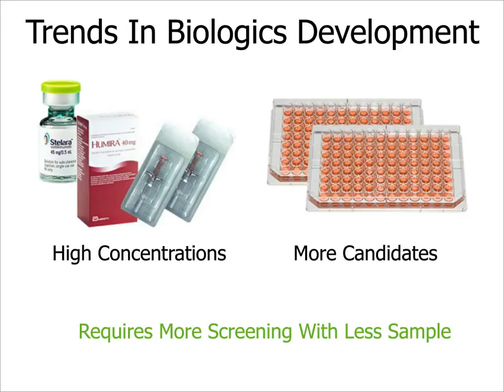And we're also seeing a trend towards screening of higher candidate numbers. So we want to characterize better different mutations or variants of our proteins in order to have a better idea of what we're seeing. But all this requires more screening, and it all requires it with less samples. So what's the problem? Why is this so complicated?